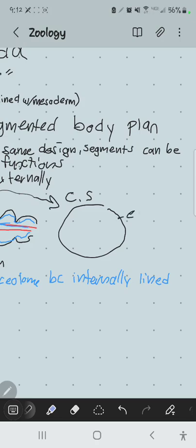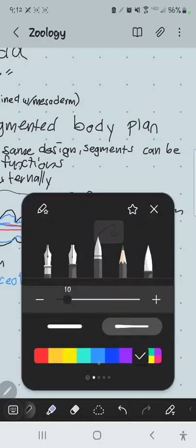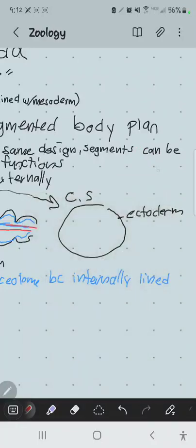And then we have mesoderm lining not only the outside part of the body cavity like we saw in the nematodes, but the mesoderm is also surrounding the gut tract there.